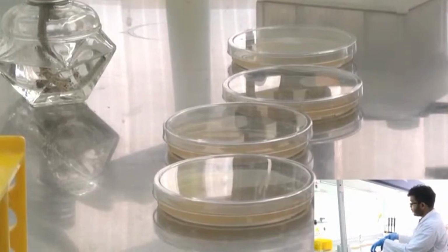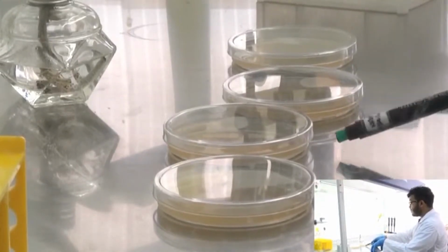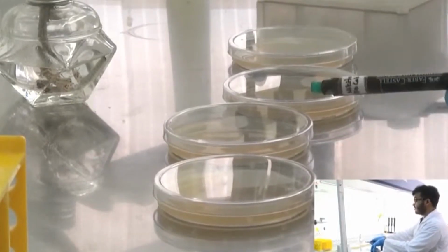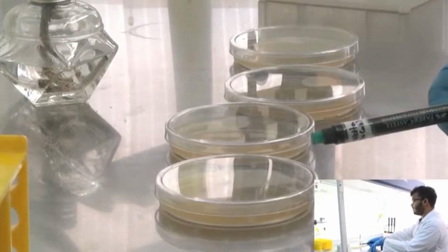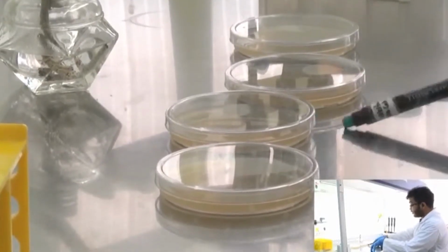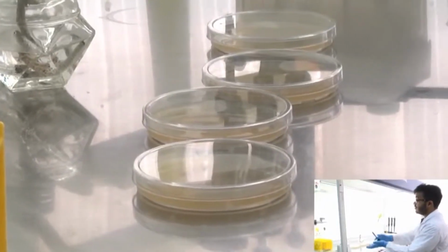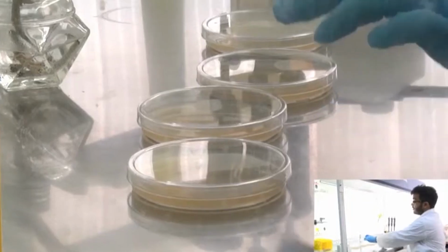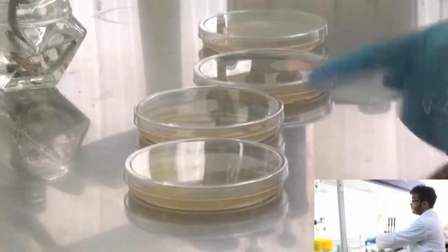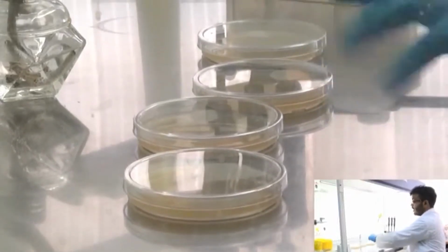Also, when labeling, mandatorily you must label the bottom dish because the lids might get interchanged. You can additionally label them on the lid, but whatever you do, the lower dish must be labeled because that is where the LB agar media is and that is where the bacterial colonies will grow. Because by mistake, in case you interchange the lids and the lower dish is not labeled and only the lids are labeled, then you are going to draw completely wrong conclusions if a switching happens.